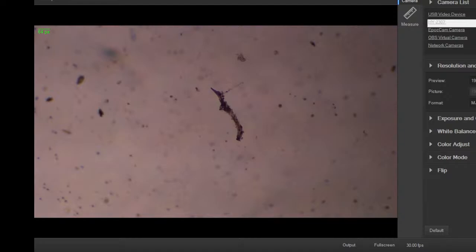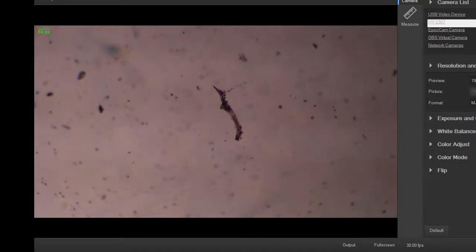It's been raining a lot. We had lots of puddles and stuff. They're starting to dry up again, but I was able to find some wet leaf debris and some standing water in a few spots around the complex here. So I thought I would do some more samples. This one I'm going to do some with the dissecting scope too, because the wet leaf litter might be interesting under the dissecting scope, which is lower power.